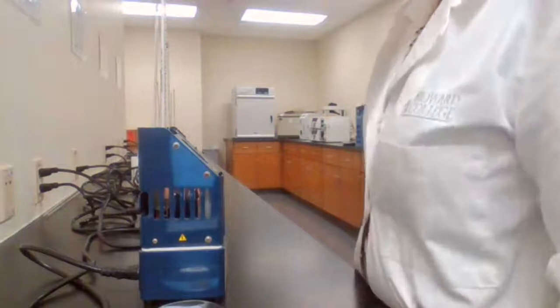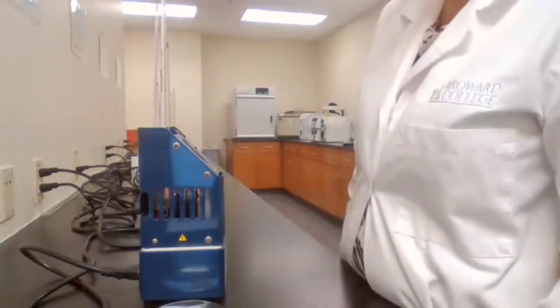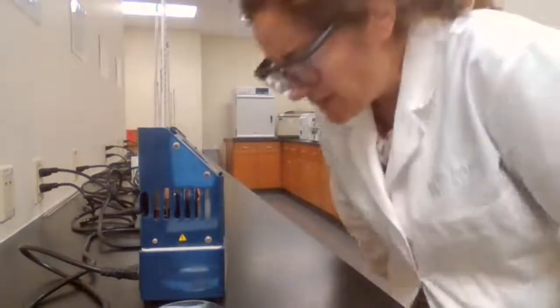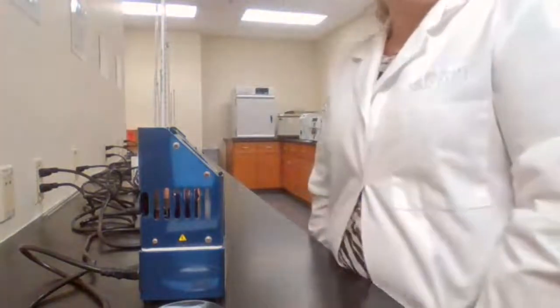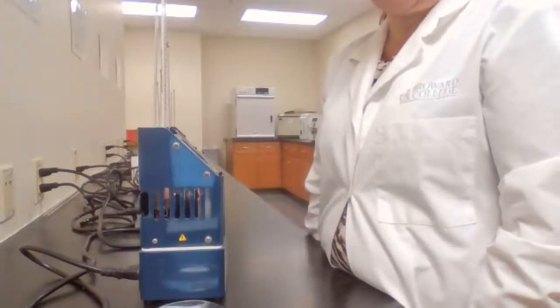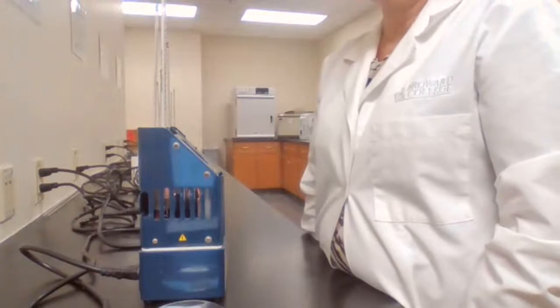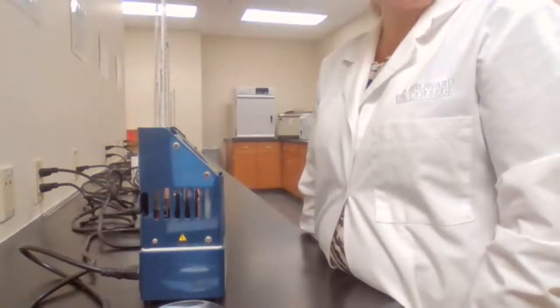Okay, if you have any comments or questions, at this point we have time. We're waiting for it to melt. If the sample melts close to 113, 114, that means we have a pure sample. The closer the melting point is to the literature value, the more pure the sample is.